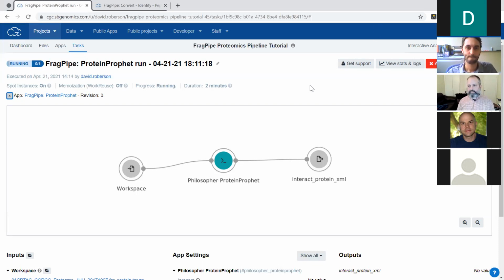Great. Thank you. Another awesome question. That's a great point, because I'm glad Felipe's on the call. He's the expert for these tools, and he can explain it very well. So let's just keep running the workflows. I want to do another pivot, because I think Felipe led us into the next tool. So the next workflow is to do filtering and quantification.